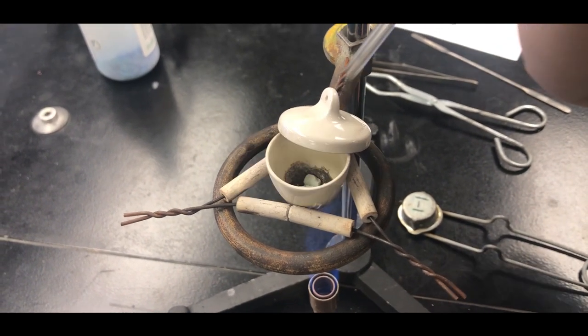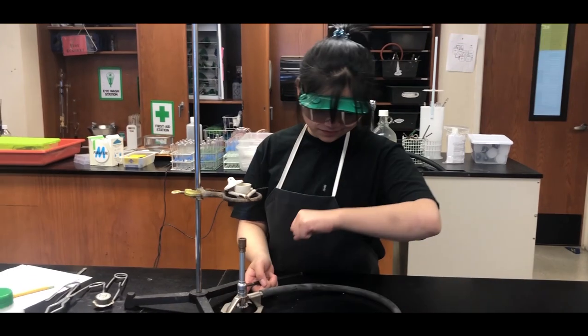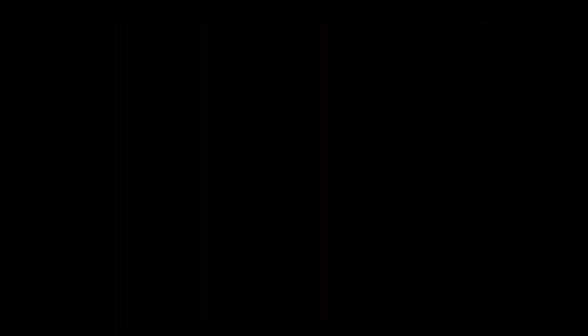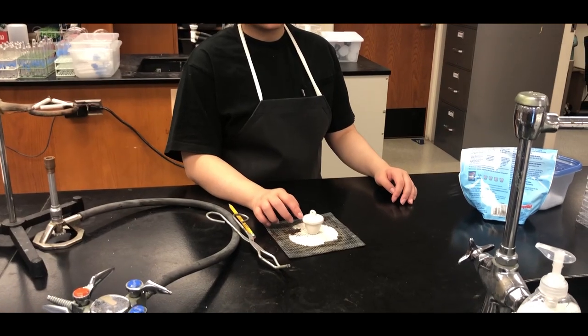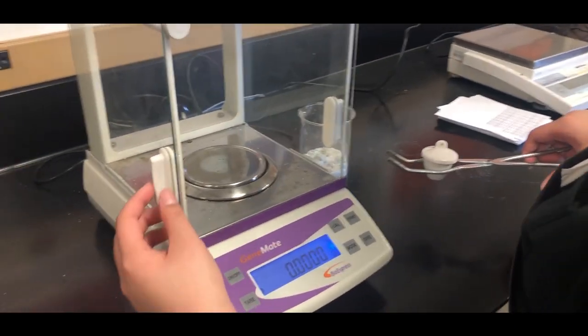Step 6, reheat the anhydrate. Follow the procedure of step 4 and 5, but this time, heat the compound for 5 minutes. 5 minutes later, measure and record the mass of the anhydrate after it cools down.